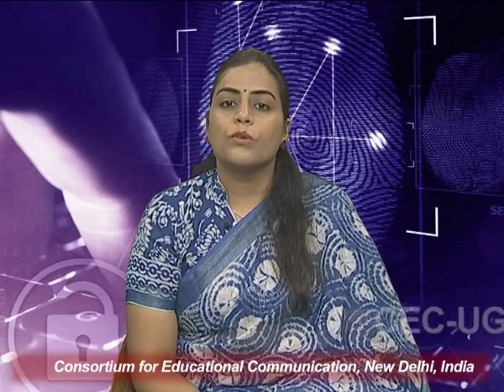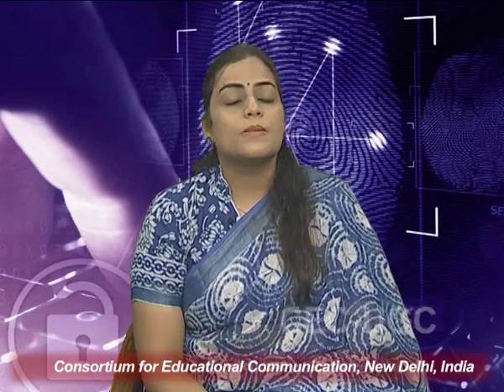Whenever we are using a centrifuge, the tubes in the centrifuge could be straight or tilted so that the centrifugal force can pull denser substances towards the bottom of the tube. In certain cases, as we have observed in forensic biology, when we extract the DNA from the various biological materials found at the crime scene, this is a very important technique.